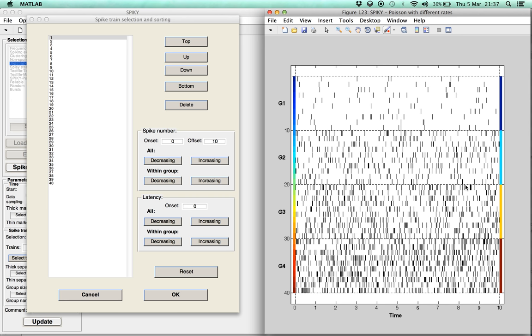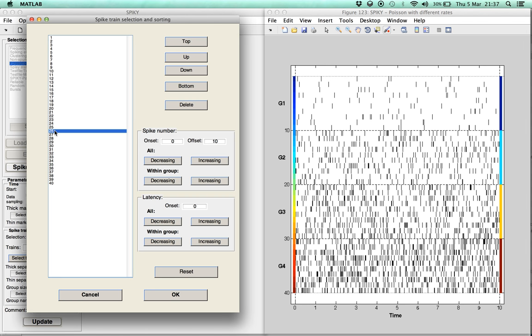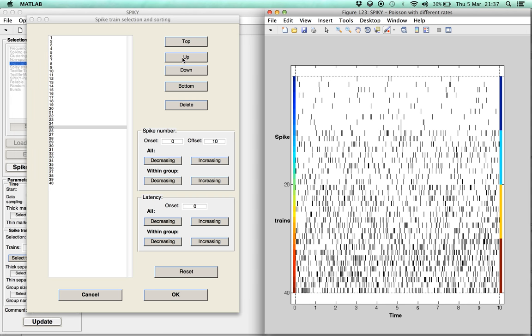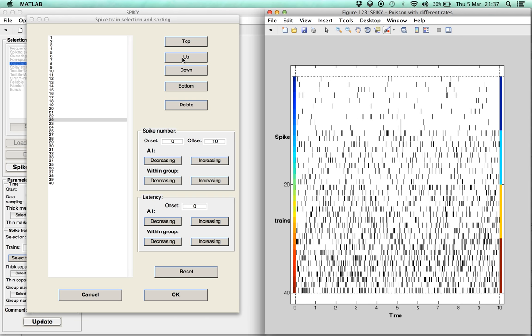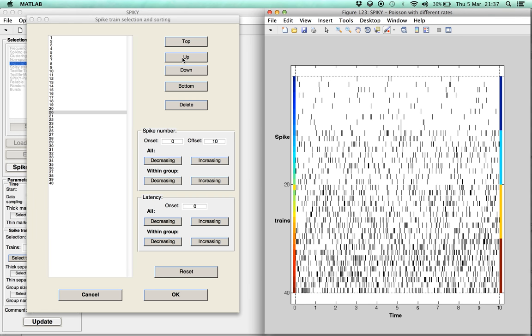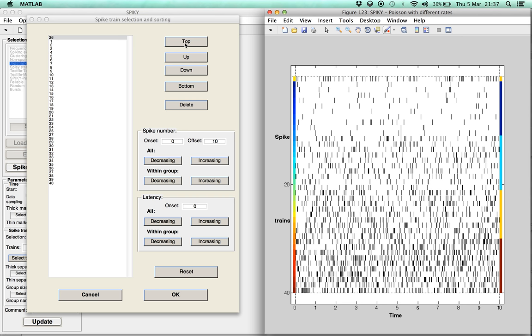In the first part, we demonstrate how the spike trains can be sorted by hand. There are a few possibilities. One is to mark individual spike trains and move them, either position by position, or directly to the top or the bottom.